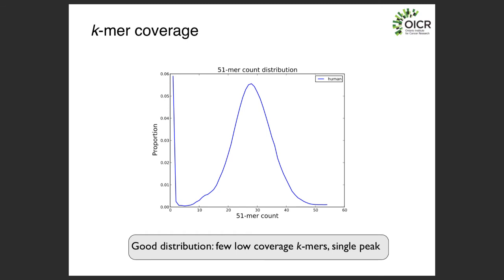Yeah, that's a really good question. And something people, when we started doing de Bruijn graph assembly, a very common thing to do was you take your sequencing reads and run the assembler with all possible k, and then pick whichever one gave you the longest contigs. After having a few years of experience, and where data standards became solidified, where everybody got about 40x, 50x coverage for their data, the field has essentially settled on using 51 to 61-mers for your assembly.